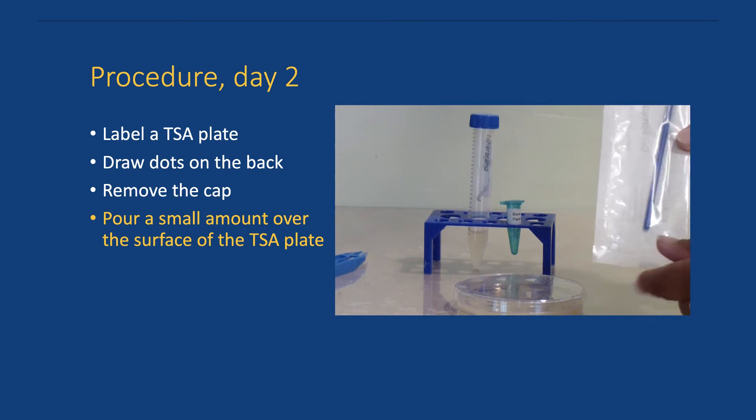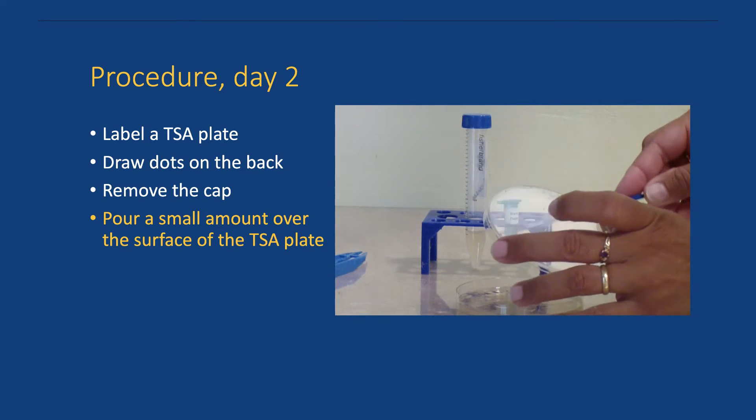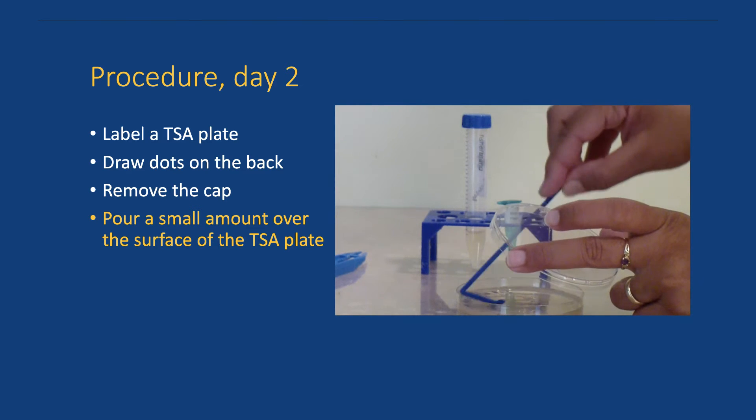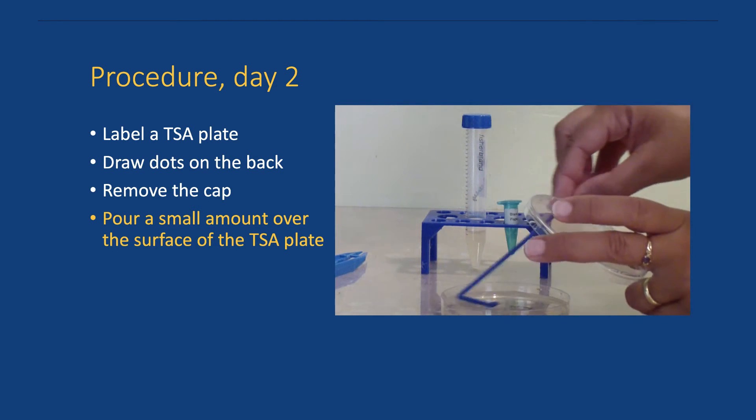Remove the sterile spreader from its packaging and use it to spread the broth over the entire surface of the plate to make a bacterial lawn. Be sure not to dip in too much into the medium and to cover the entire surface.